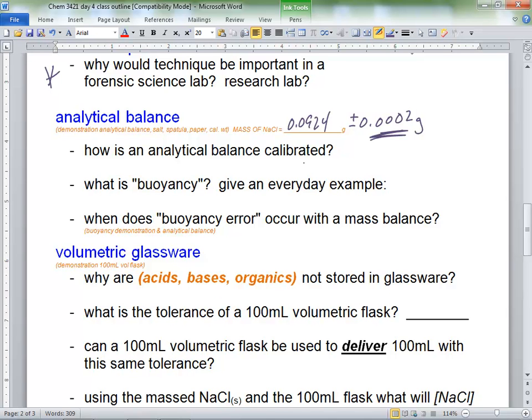So you want to fill this up with oxygen and mass it, right? So you stick in a Ziploc bag of oxygen, fill it, suck it up, so it's full of oxygen, cap it, and you could find the mass of this whole setup. But you have to find the mass of this guy empty in order to find the mass of the gas, because you have to subtract the mass of it empty. The question is, what's the true mass of it empty?